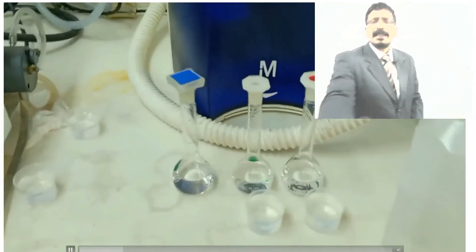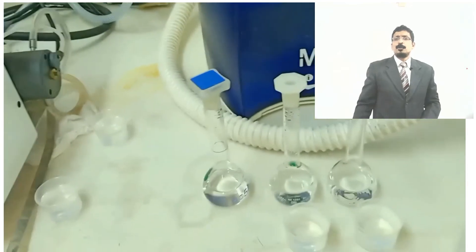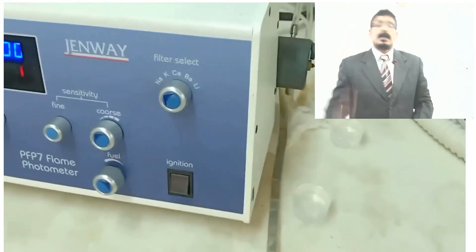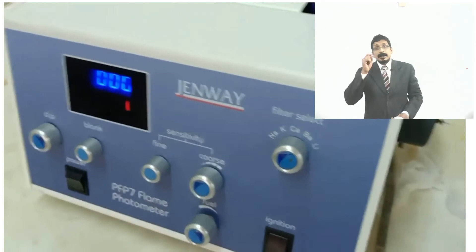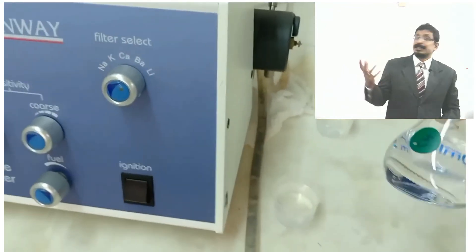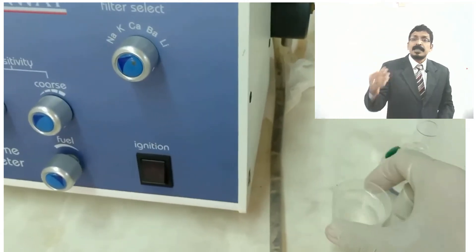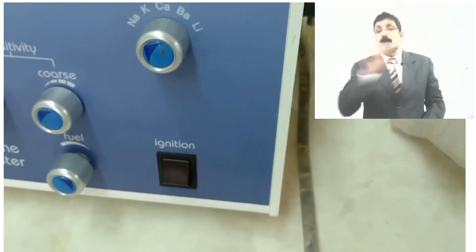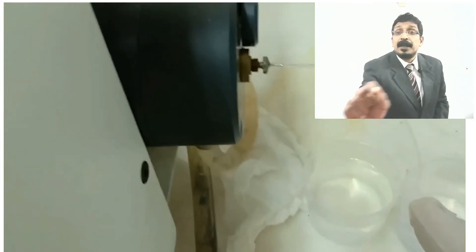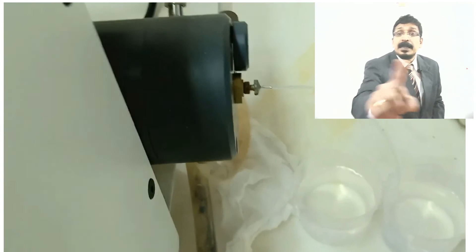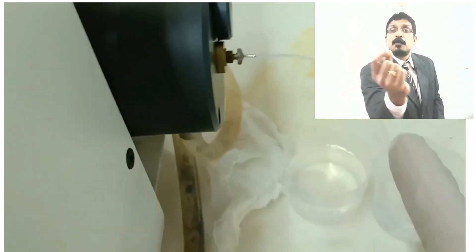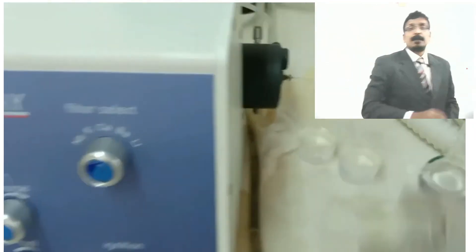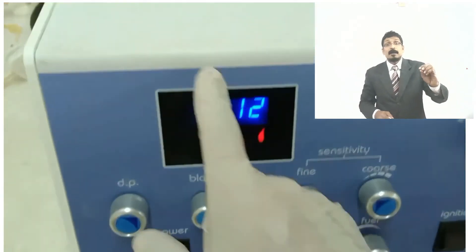Microgram per mL concentrations are used; very low concentrations are preferred for flame photometry, as high concentrations make the standard curve difficult. Take distilled water first, calibrate to zero, and you can see the capillary tube — just a plastic capillary in the nebulizer — connected to be sucked by the pressurized compressor. Then use the fine and coarse adjustment, select the correct filter (sodium, potassium, calcium, barium, or lithium), calibrate and proceed.